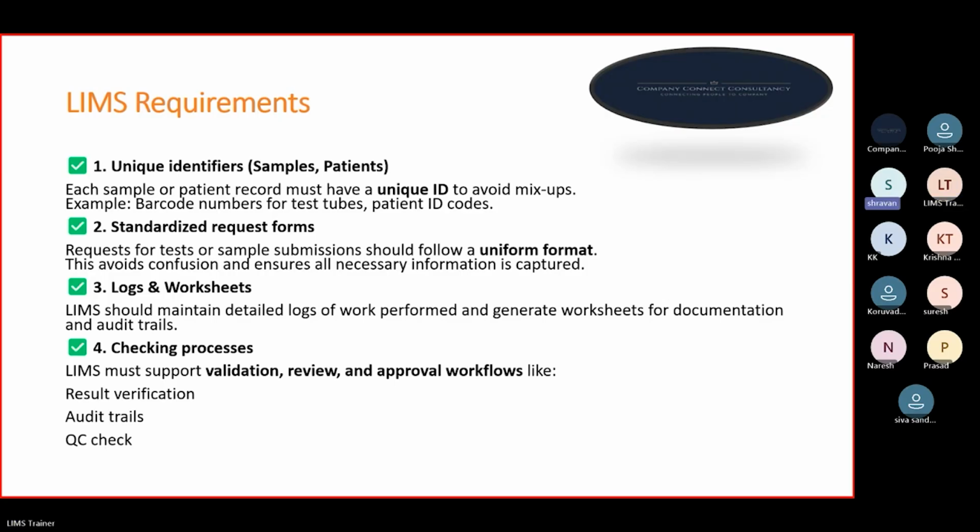After that, as a master data creator: if a pharmaceutical company already has LIMS software implemented and just wants to manage its master data, it can hand that over to the IT industry, and the IT company will hire candidates who can create the master data for them.